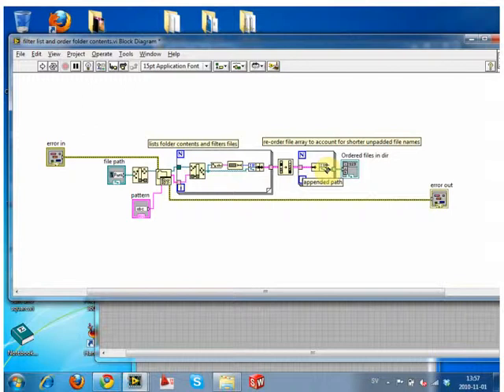So these are clusters coming in. So then we open the cluster up. Now for each article in the list, we then pull out the file name from that list. So that we've done all our ordering based on our new little string length that we've added to this ordering scheme. But then we have to pull that back off. So here you're putting it in, and here you're taking it off.